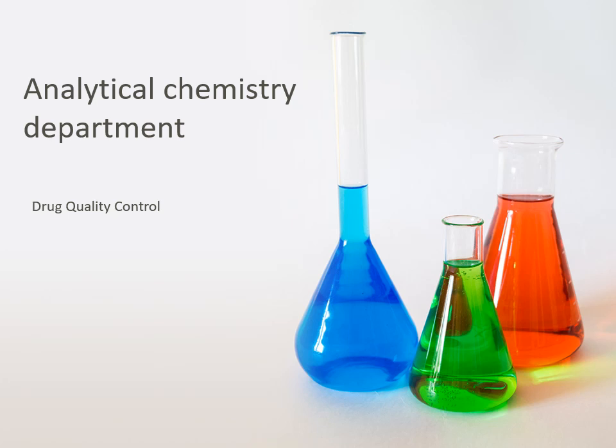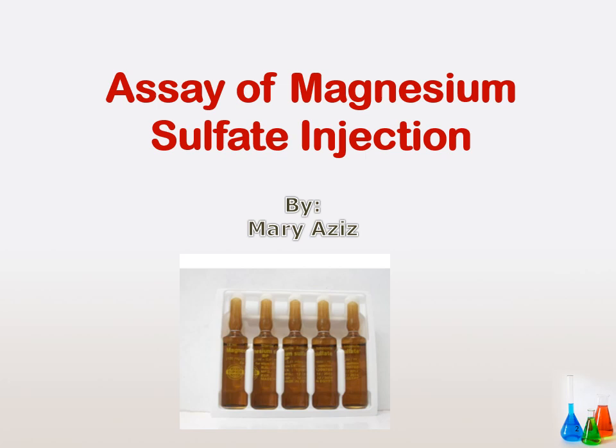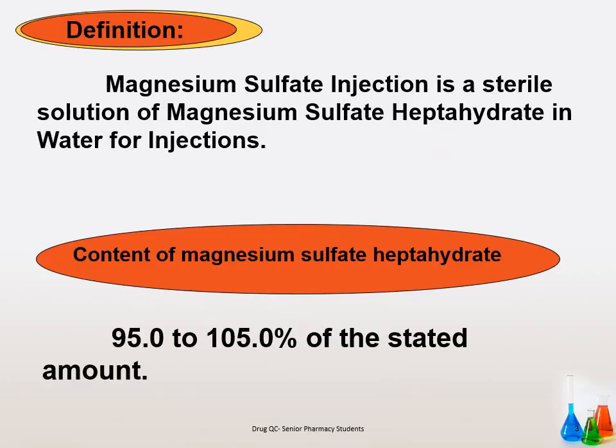Drug quality control. Assay of magnesium sulfate injection.